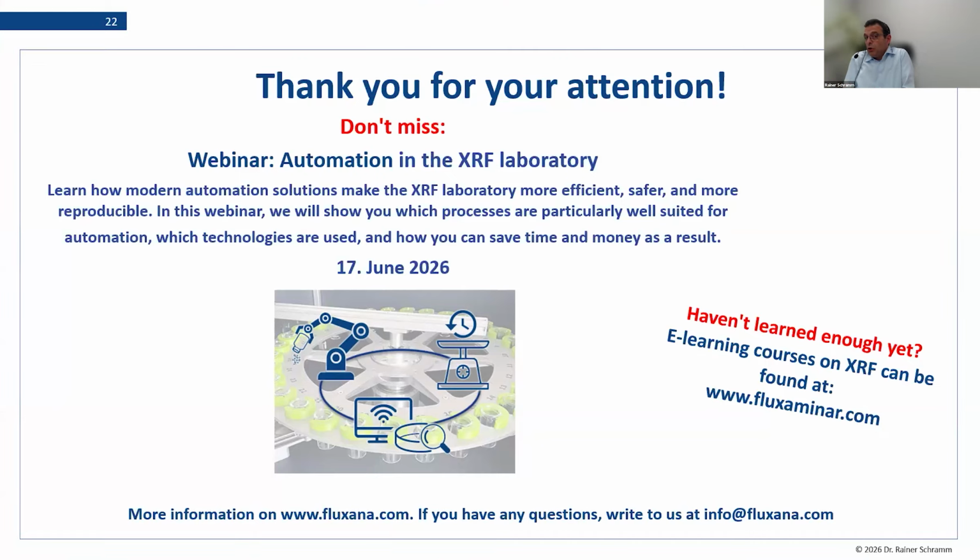This could be that you use alpha correction where you exclude the LOI, so that means automatically the LOI will be calculated, or when, of course, you are able to enter it, then you reduce the error of this calculation, and then you can give a very precise result.